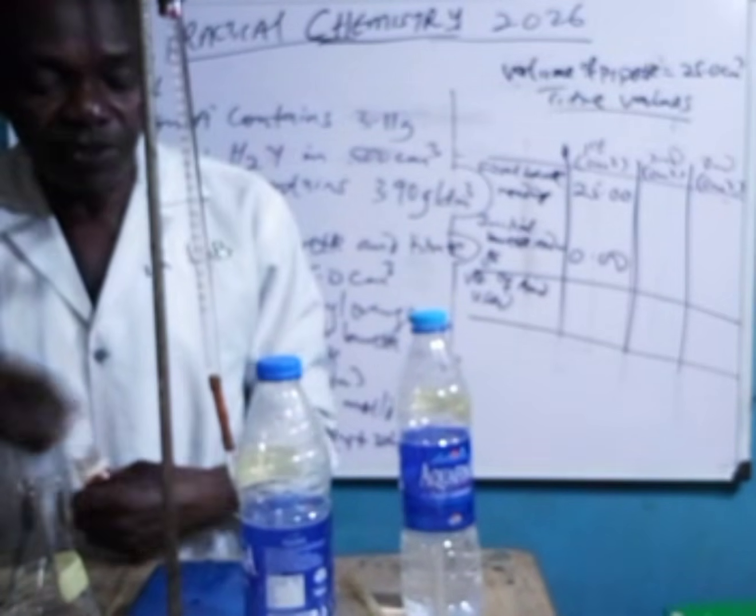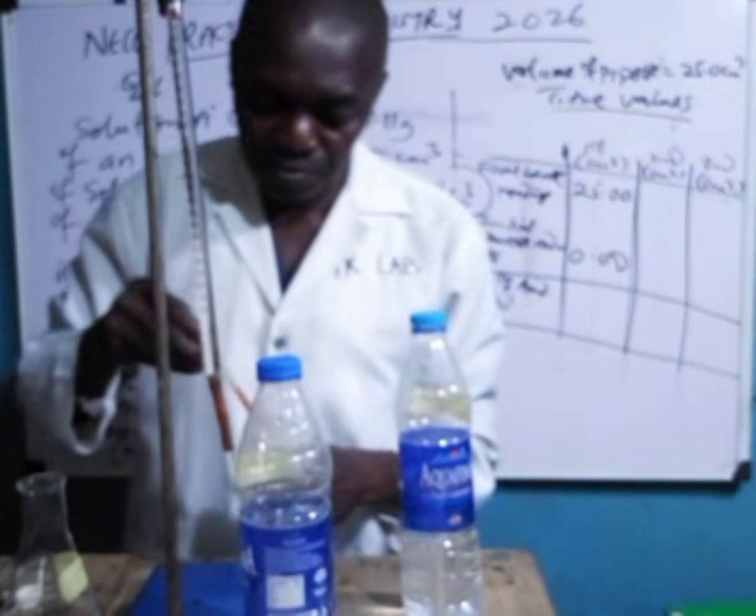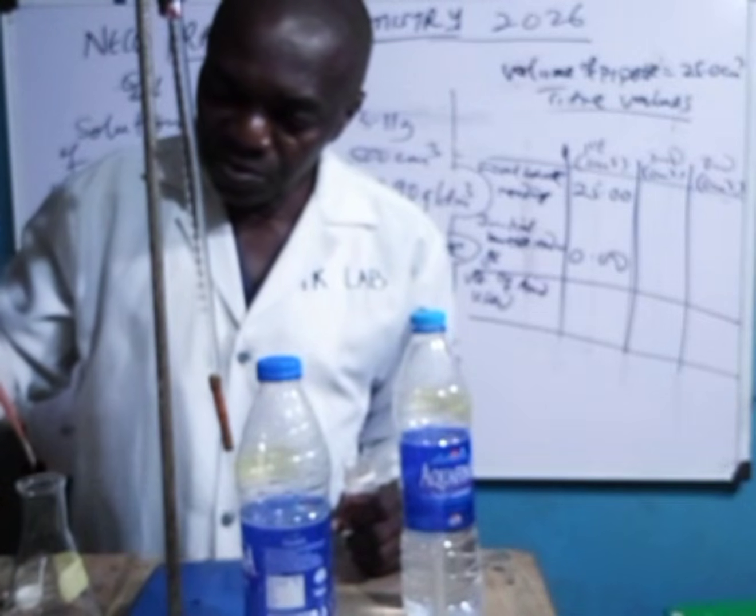Let's add our indicator. Two drops. 1, 2.